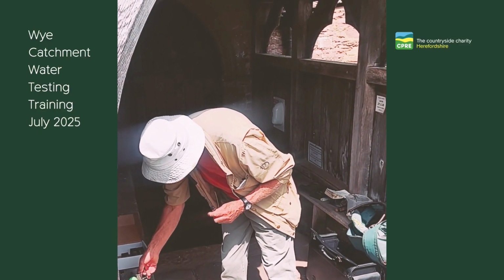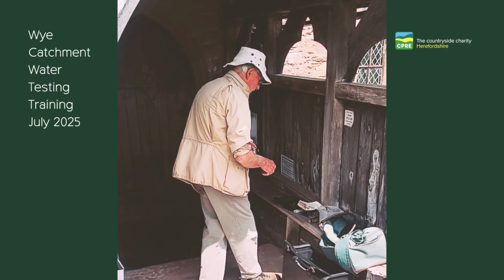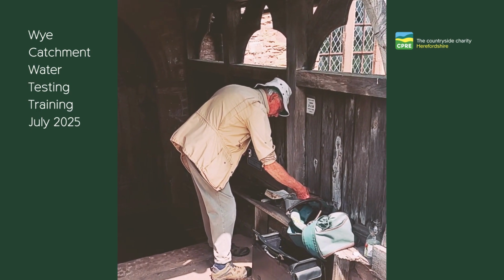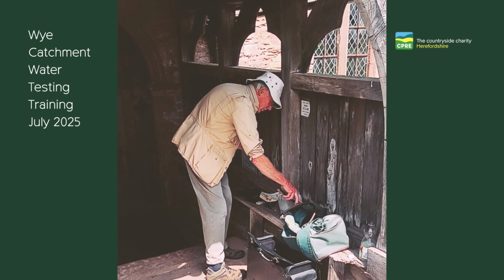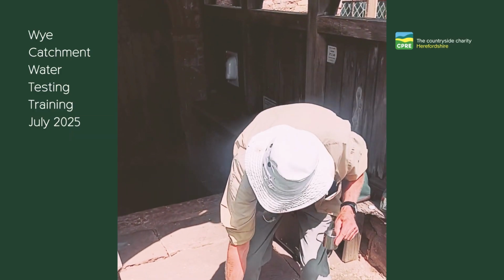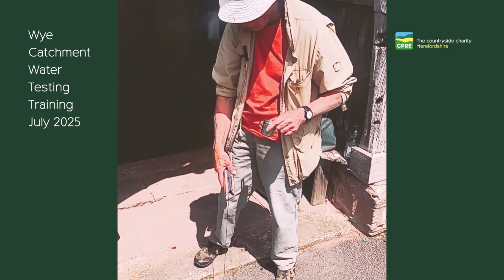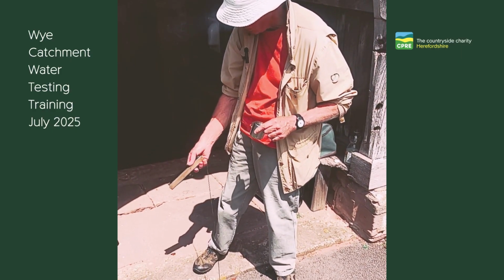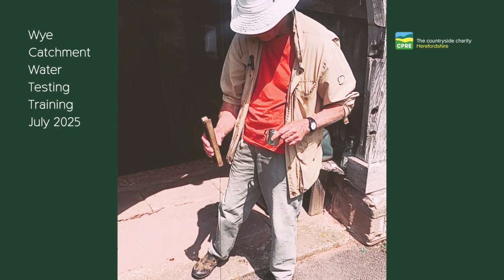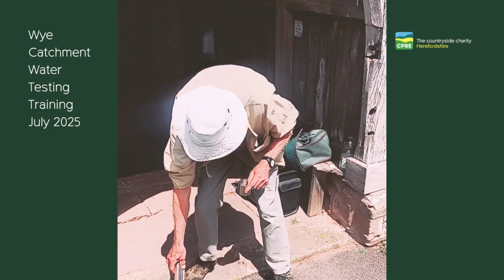I should have mentioned that to take your sample, you need a very simple arrangement of a jug with a piece of string on it, basically. This is the one that I use. They're very easy to knock up. You can get a jug from any supermarket for about 80 pence. Bit of suitable cord or string and some means of lowering it to the water.